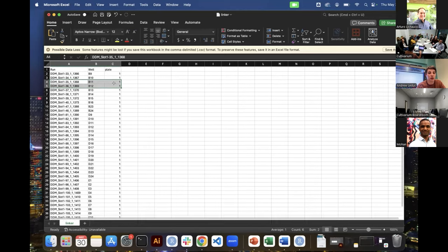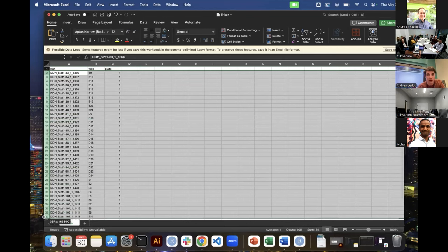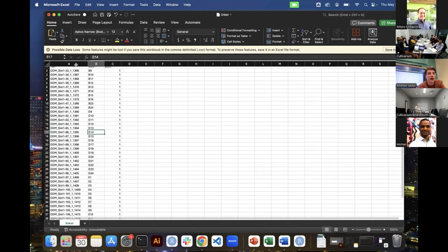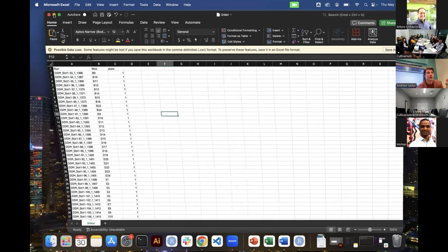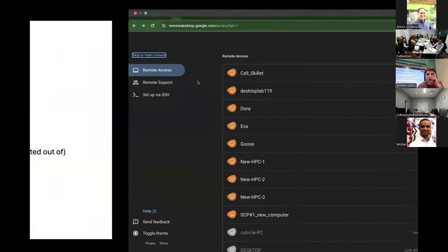The other important thing, and an aspect I didn't mention, is that you do want to order this in order of when you ran the raw files. With the Orbitrap instruments, it's really easy because they append this number at the end, so it's pretty easy to sort these and make sure they're in the correct order. Now this is the 1367th run, 1368. So you can double check that. And I'll explain why this is important in a little bit. But it's a super simple thing to make. It only takes you a couple of minutes.